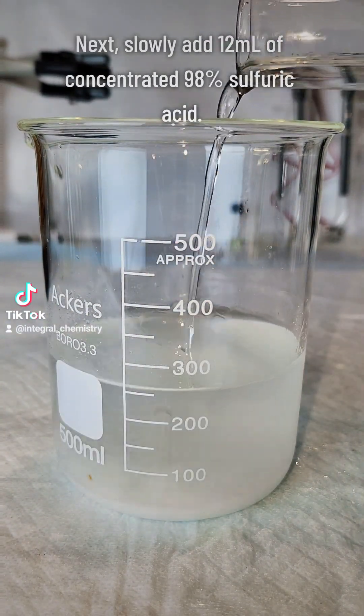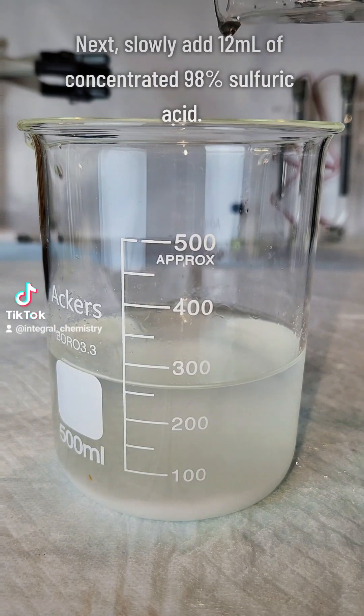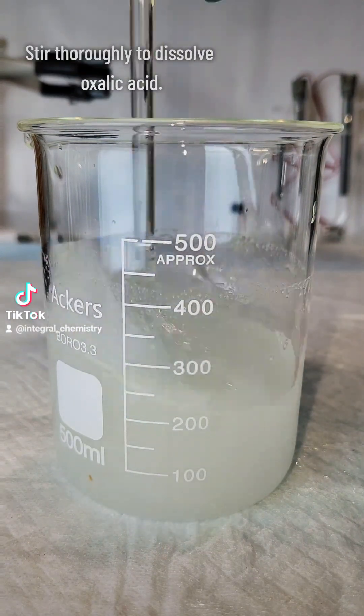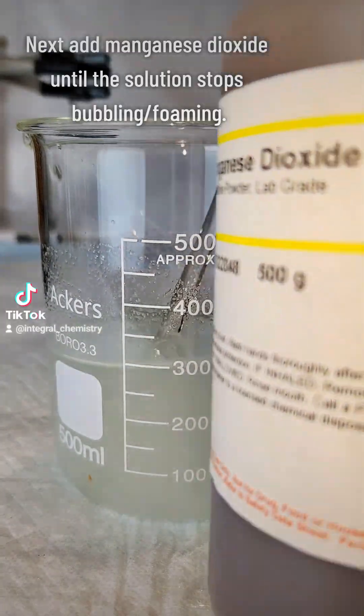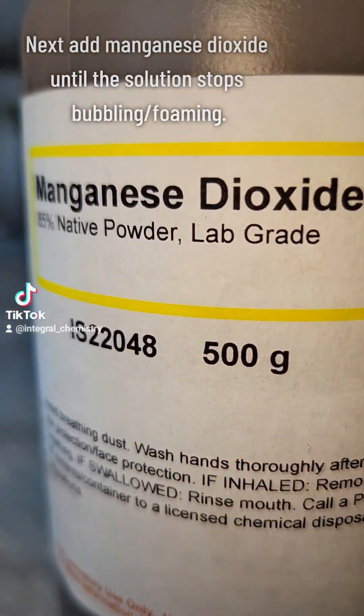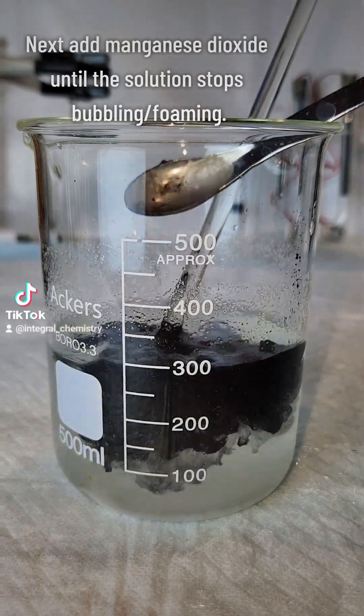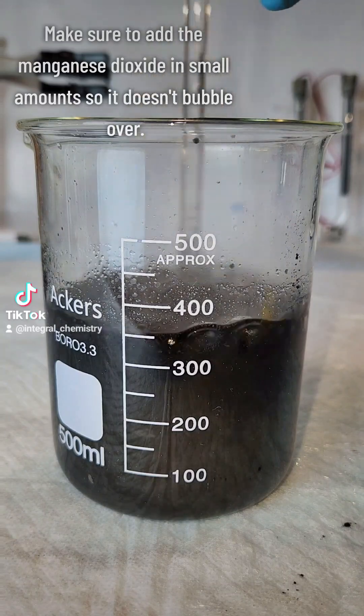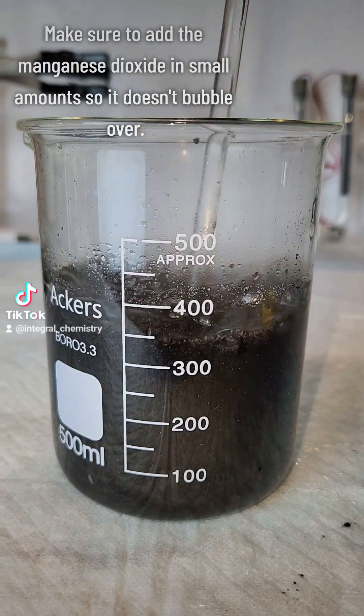For method number two, I begin by dissolving 30 grams of oxalic acid dihydrate in around 250 milliliters of water. I then add 12 milliliters of concentrated sulfuric acid and mix it thoroughly. Next I begin making small additions of manganese dioxide to the solution and stir thoroughly between each addition to make sure that it doesn't bubble over.